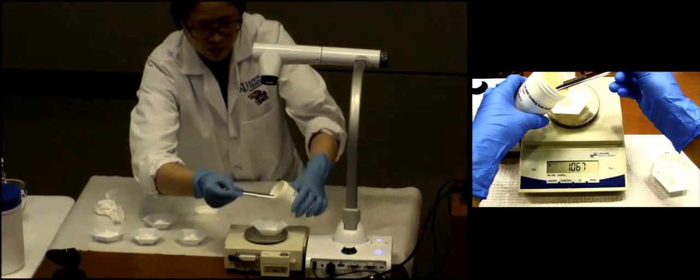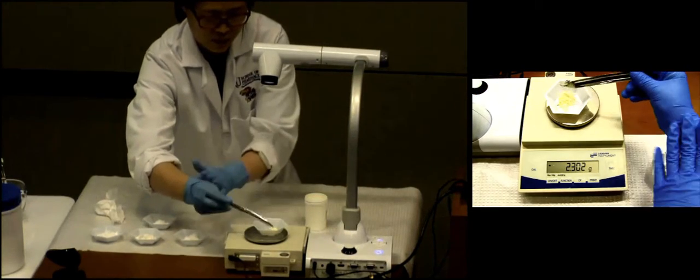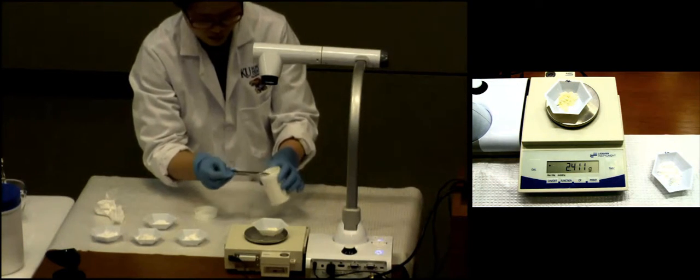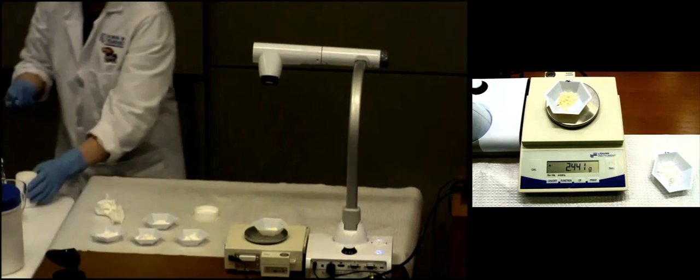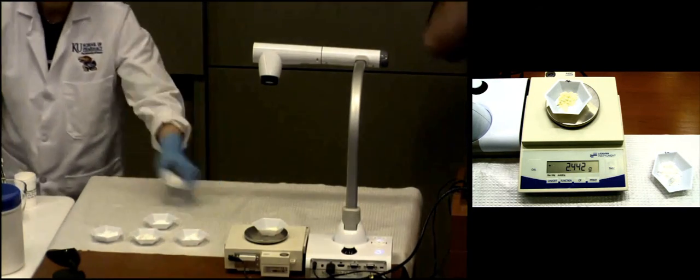She's doing that. I will remind you, you guys are going to be going out there with a weigh boat and getting a certain amount of the stock container and then going back and weighing at your station. If you do find that you've taken way more than you need, please return it, and it's labeled. I would appreciate if you would return the excess to the stock so I don't waste quite so much money. Any extra that's not that much or significant, you can just discard in those blue trash cans by the microwaves in the powder trash.